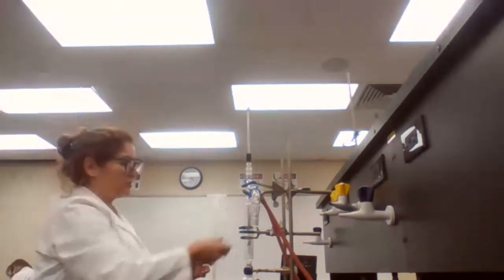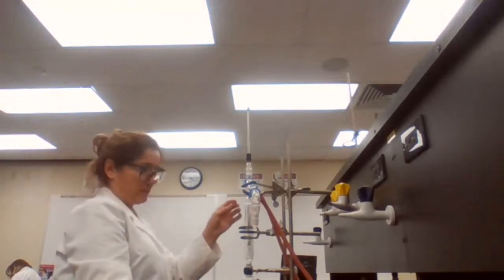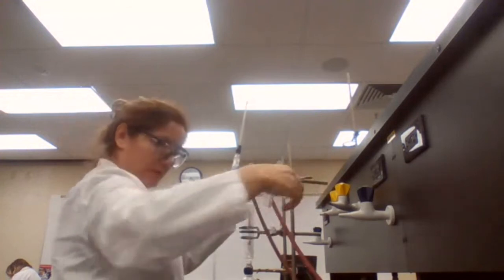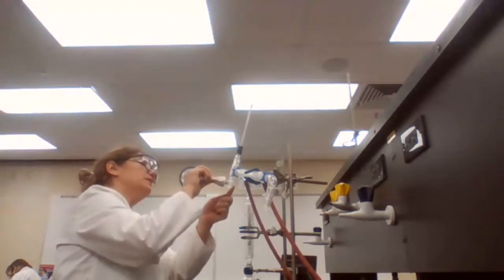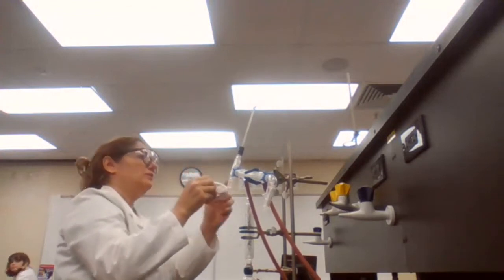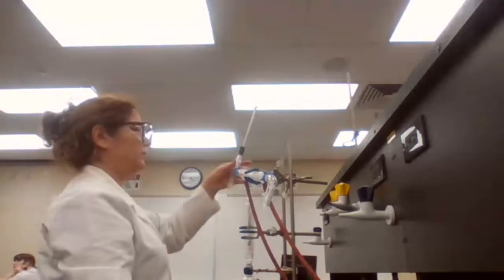I added extra glass here, so I have to use a clip to make it sealed again. One thing I forgot is to re-grease the glass joint here. I'm going to take it out. Even though it was greased already from the previous setup, it's better to make sure that enough grease is applied, and it will help both aspects of greasing.